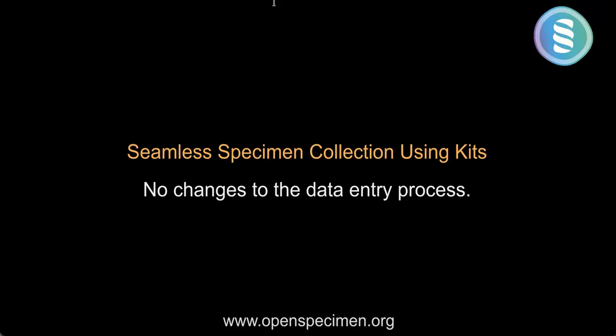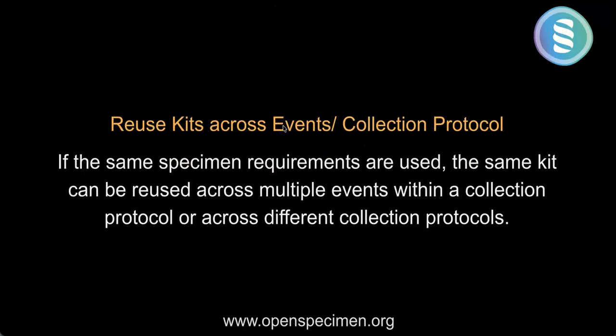Now let's look at the next part, that is reusing kits across events and collection protocols. So in some clinical studies, the specimens collected across the events within the collection protocol, or across collection protocols, can be the same. That means the specimen requirement defined will be similar, right?